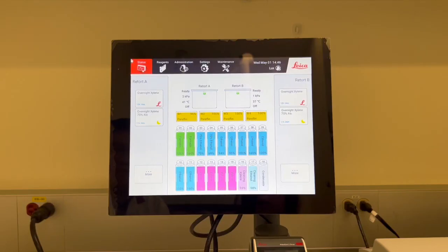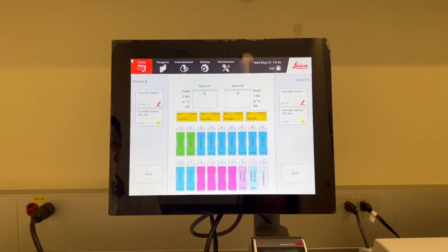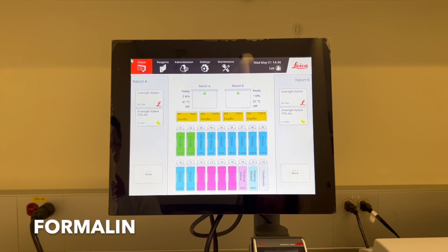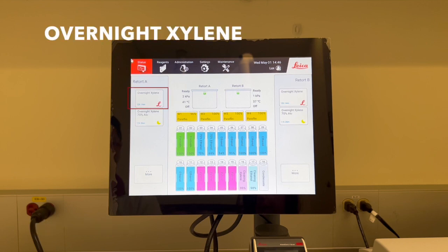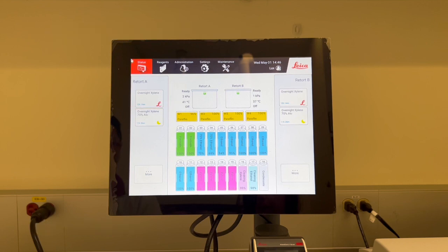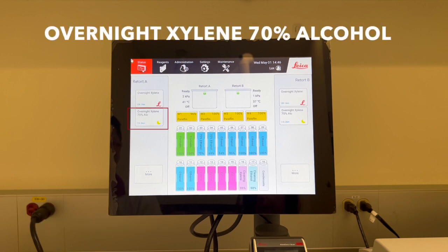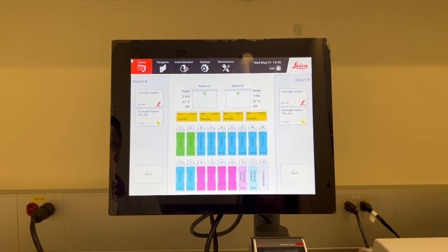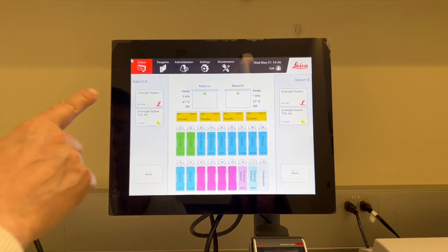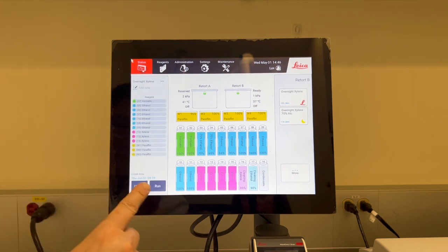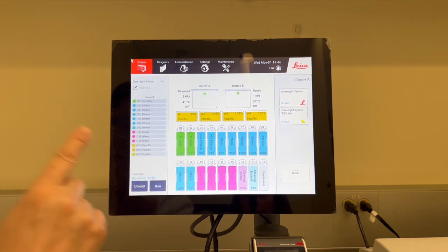There are two protocols under the favorite protocol list, overnight xylene and overnight xylene 70% alcohol. It depends on the situation of your samples to decide which protocol you should use. If your tissue samples are in formalin, you should choose overnight xylene. If your tissue samples are already in 70% alcohol, then you should choose overnight xylene 70% alcohol. In this case, our samples are in formalin, so we will select overnight xylene, then press run.